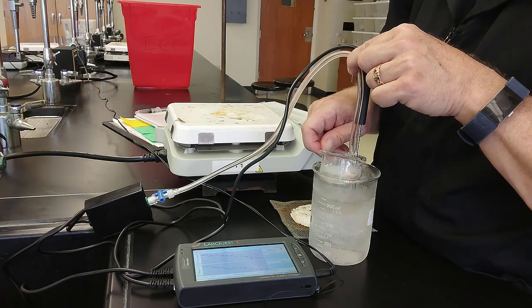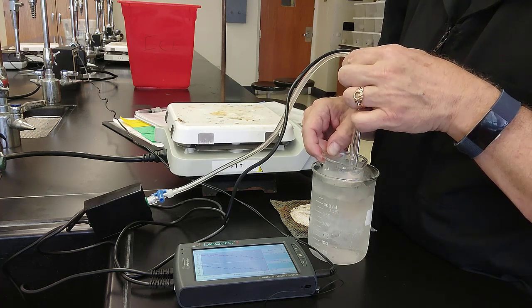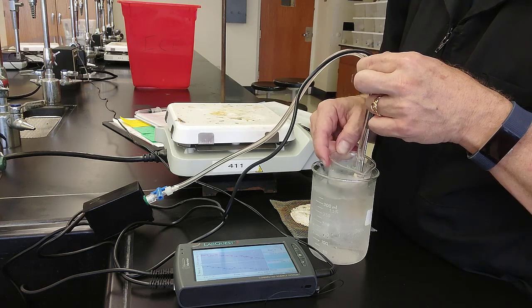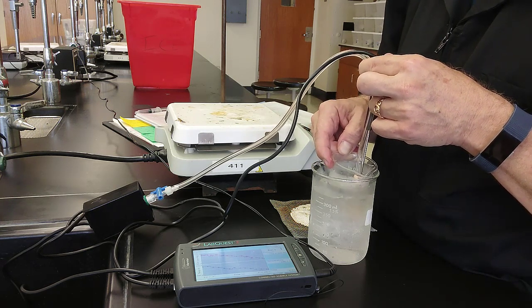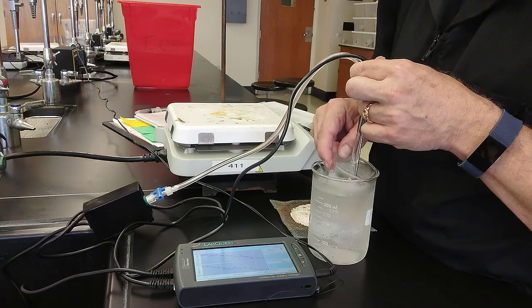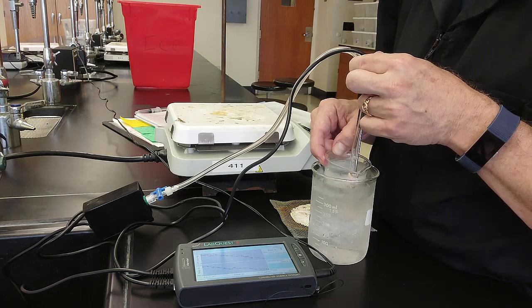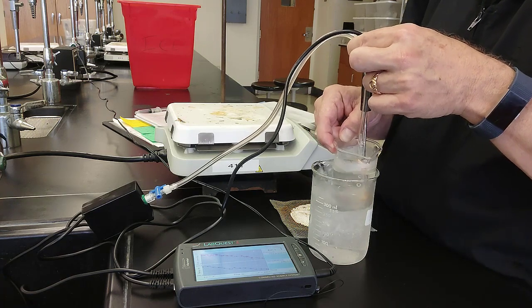Oh, looks like our run stopped at 3 minutes. I did not check my time of my run on here, so I should have done so. All right, so I have 3 minutes, and our temperature has dropped down to 296, and our pressure has dropped to 751.